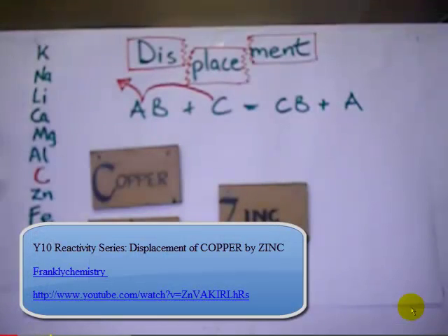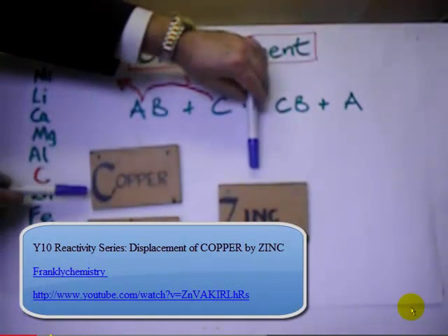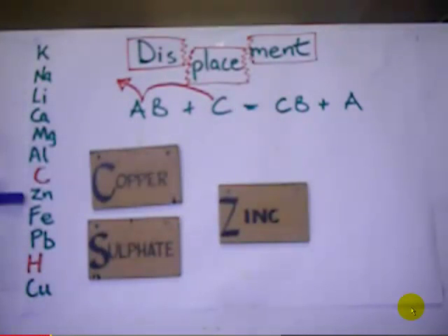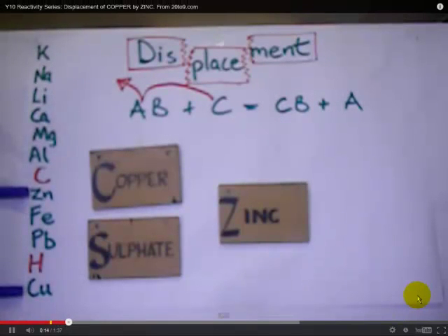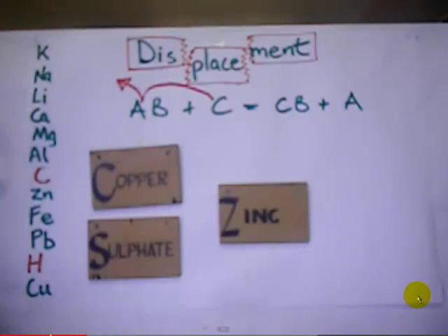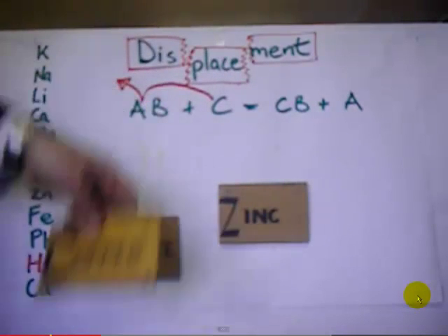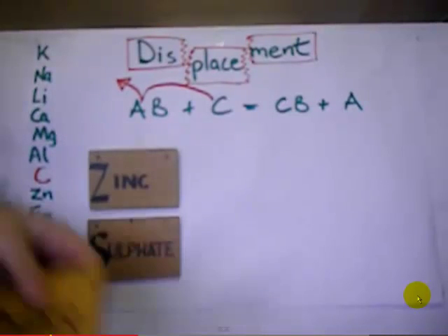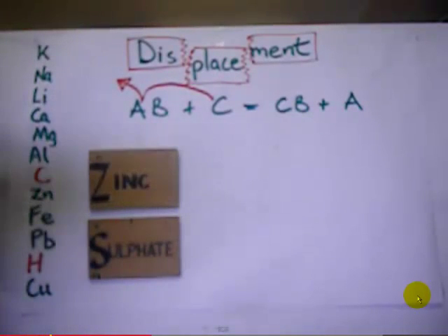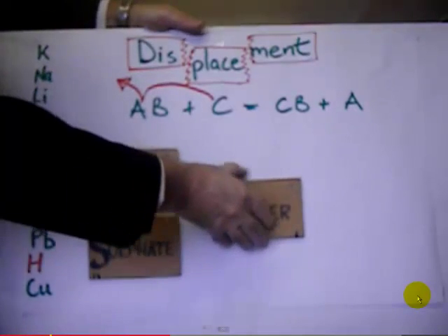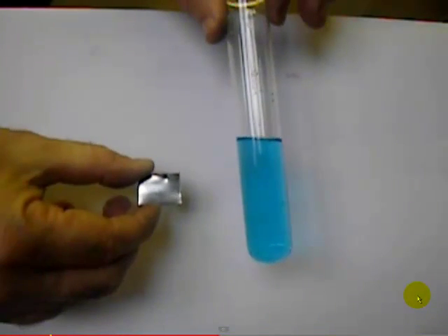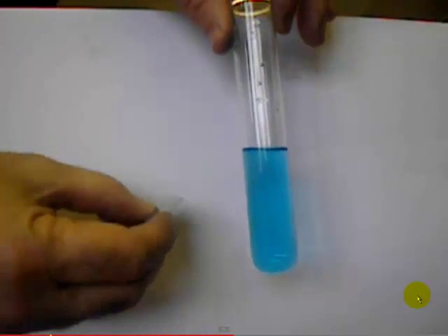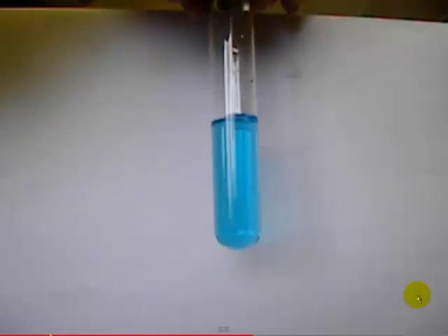Let's take a look at the displacement reaction where zinc metal displaces copper from its compound, copper sulfate. Here's the location of zinc in the reactivity series — and copper. Zinc is considerably more reactive than copper and can displace it from its compound. That blue solution of copper sulfate will change to form a colorless clear solution of zinc sulfate, and copper will be produced. Here we have the starting materials: a blue solution of copper sulfate and shiny grey zinc foil. Watch how the shiny grey surface immediately blackens as we drop it into the copper sulfate.